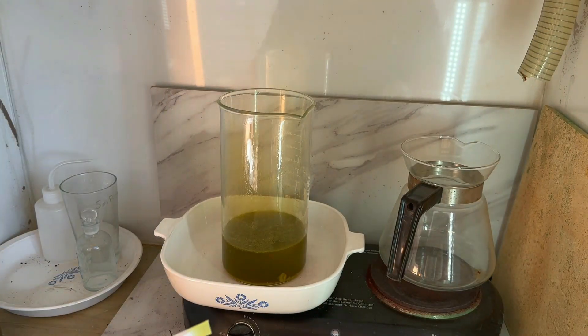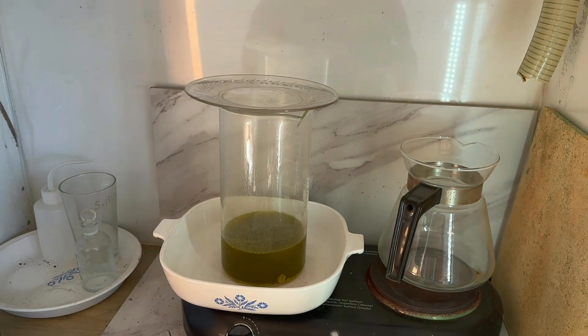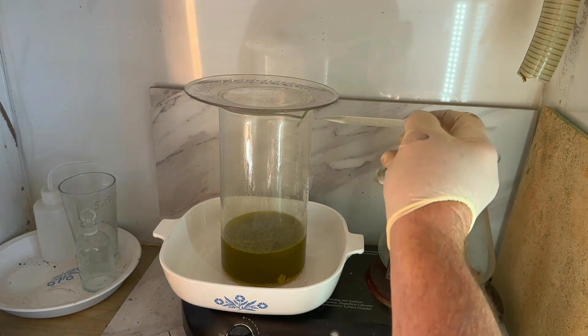Our solution has been cooking for about 30 minutes. I'm going to do a quick stannous chloride test to see if we have gold in solution — we do, nice dark stain. There are still some solids in there, so we're going to add a little bit more nitric and let this cook for just a little bit longer.